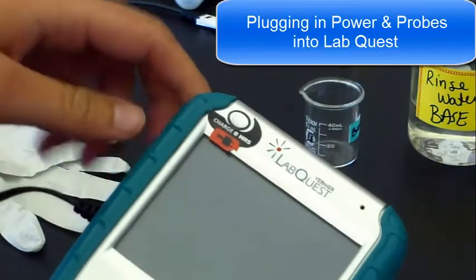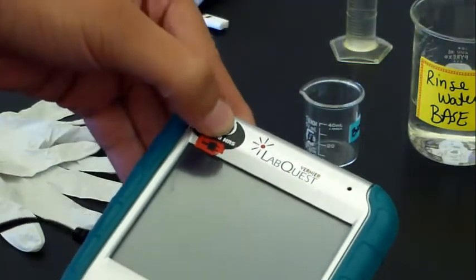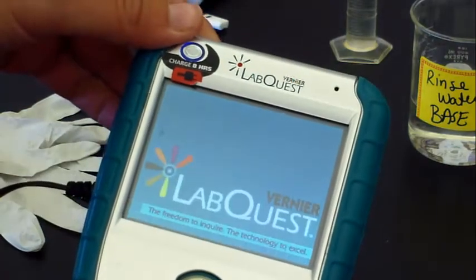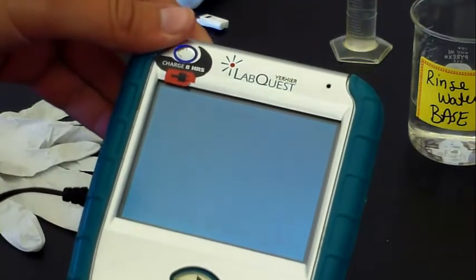That is where you plug it in, and then the power button is in the upper corner. Just turn that on. We have to hold it, and then you should see where it says LabQuest. If there's any problems, contact one of the teachers.